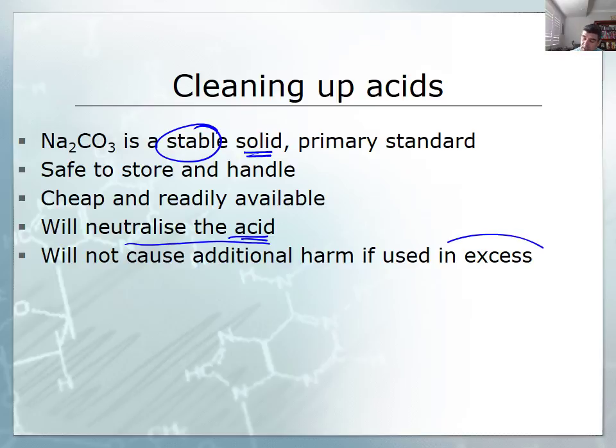What's very important is if we go overboard and just throw a whole heap of this particular substance in because we're not sure how much acid is there or what its concentration is, then if we use this in excess, it doesn't matter. It's a very safe chemical to choose and use, and it will do the neutralization job without leaving any corrosive residues behind.